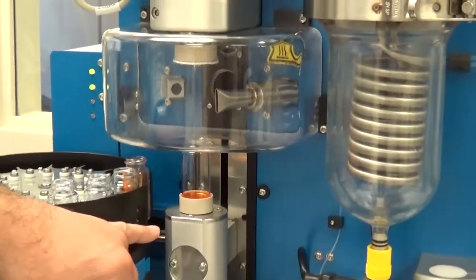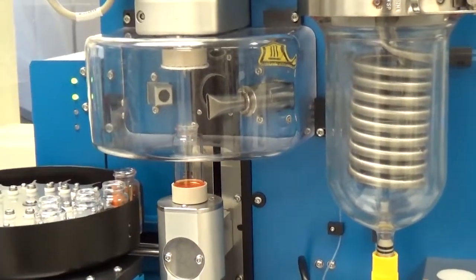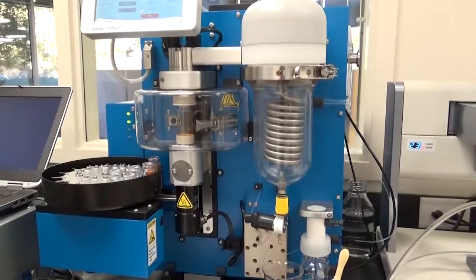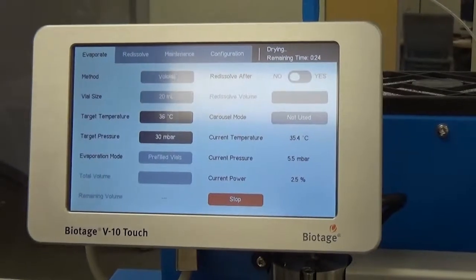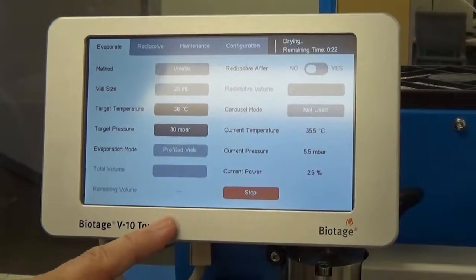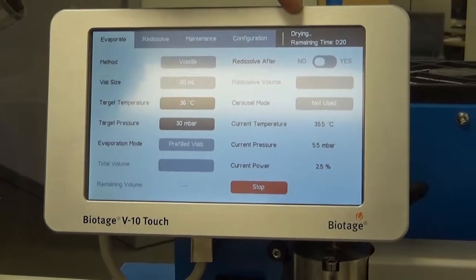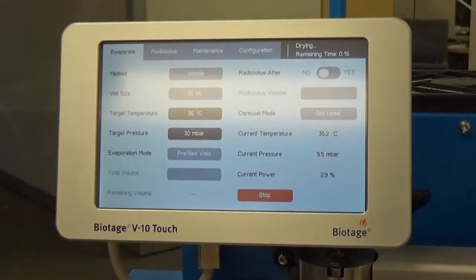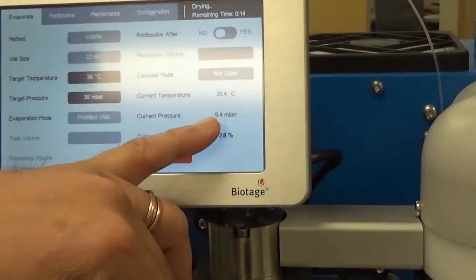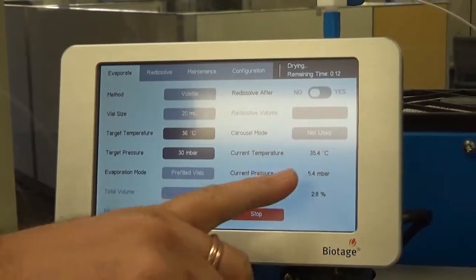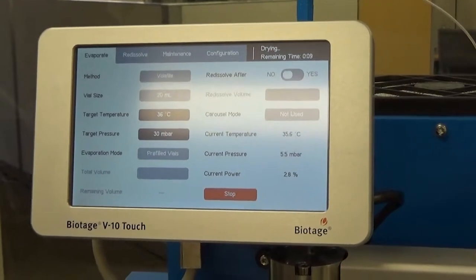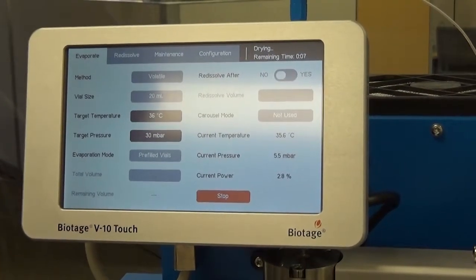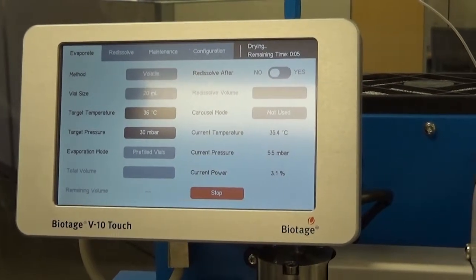And if you can watch here, you'll see the vial start coming up. So it's getting toward the end of the run now. We're in the drying step. And what it's been doing is it took it down to a very low pressure, in this case, 5 millibar. Currently, the temperature is at 35 degrees C. And we're just waiting for the vial drying to finish.